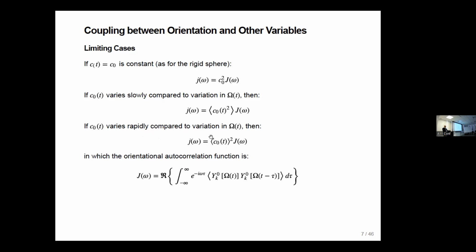So we actually need to take the square of the 1 over r cubed distance. And that turns out to be a little longer than what you would find in a quantum mechanical force field.